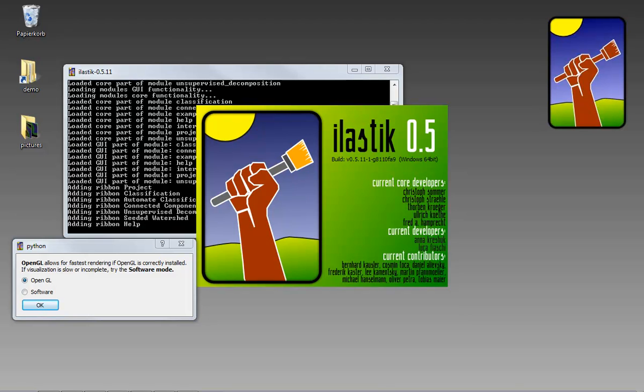Hi, I'm Fred from the Ilastik Team. In this video I will show how the Seeded Watershed can be used to interactively segment 3D images. Much more details on navigation and how the method works are available from the videos further down on the documentation page.